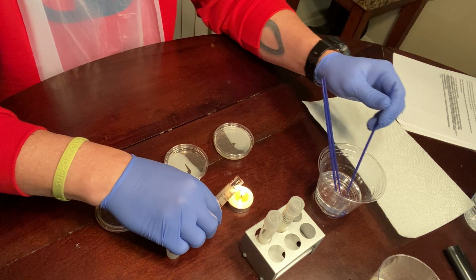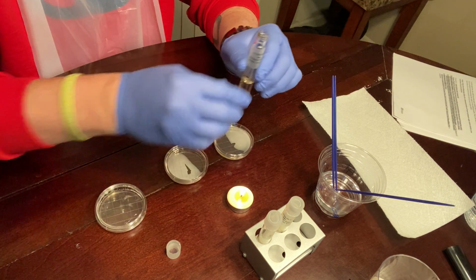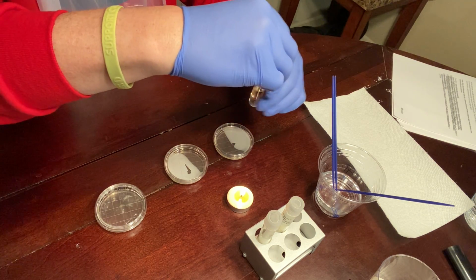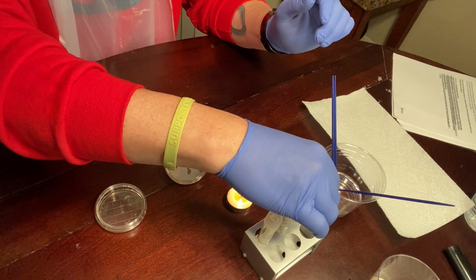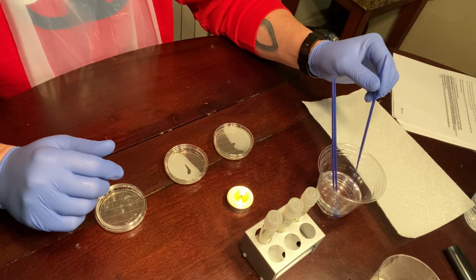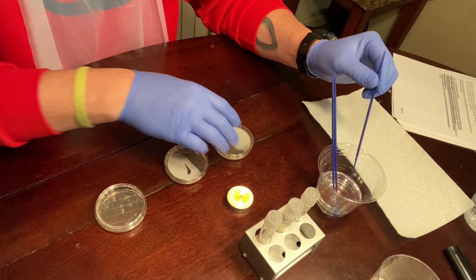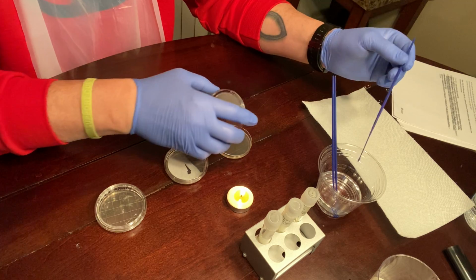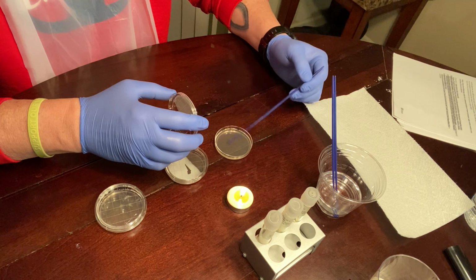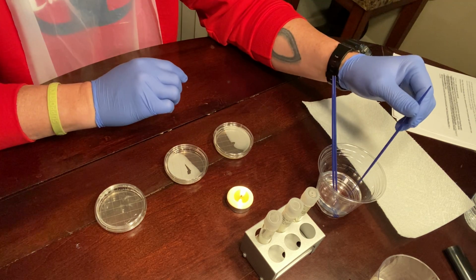Put this back in the alcohol. Sterilize my tube again. Replace the lid. For 20 seconds. So then I'm going to take samples from the first one and move it to a second area of the dish. Put the lid on, soak it again.